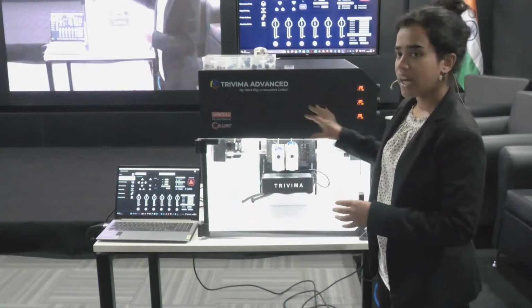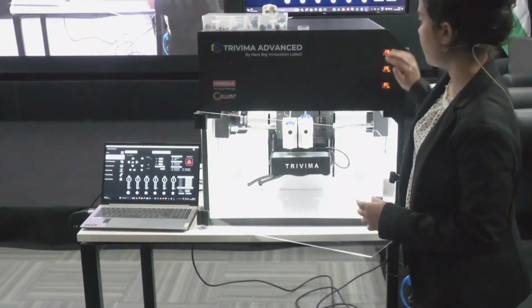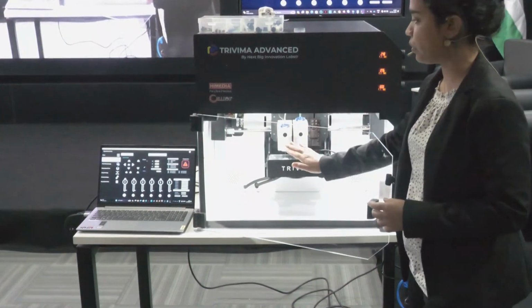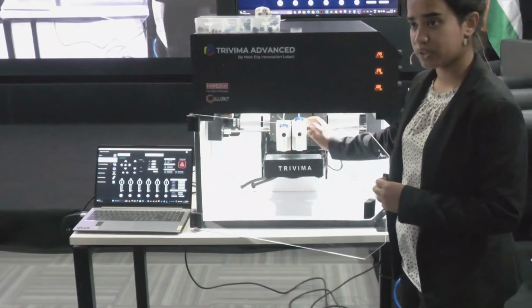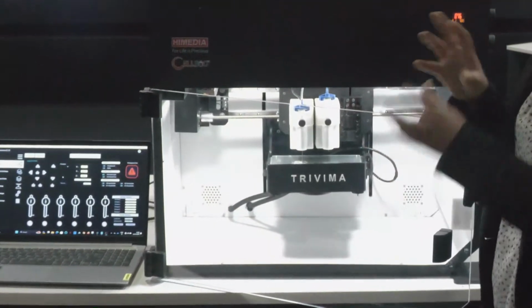So in the Trivima Advanced, we have 3 extruder heads over here. These 3 extruder heads have 3 pressure gauges that are linked to them. With each of these pressure gauges, you would be able to control the pressure of air that is being supplied to each of these extruder heads. Now these extruder heads come with a magnetic head over here, which means it is swappable.